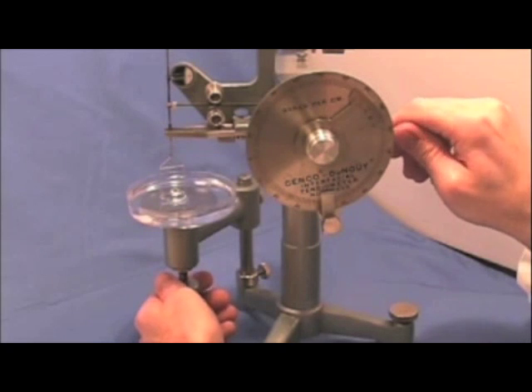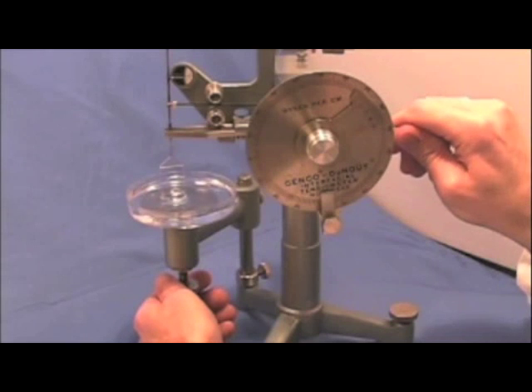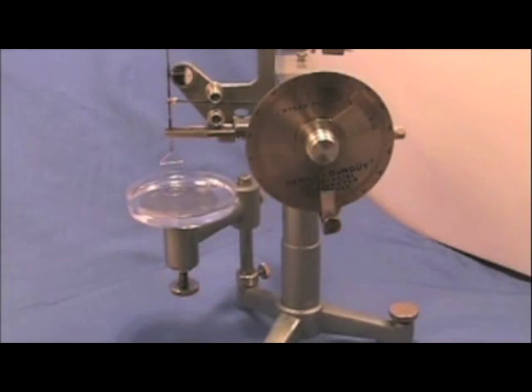I'm going to go in very small increments just again. There, now if we read the gauge we're looking at a surface tension of about 77 dynes per centimeter for distilled water.